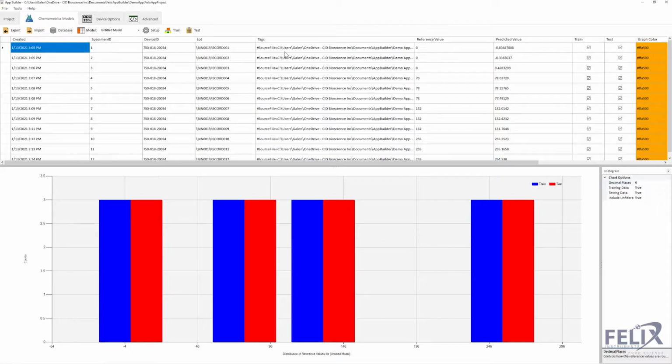But if you specify metadata within your instrument, you can actually see tags such as the cultivar, temperature levels, or any other kind of information, the name of the region where you collected that data. All sorts of valuable information can be sorted with the metadata tags.